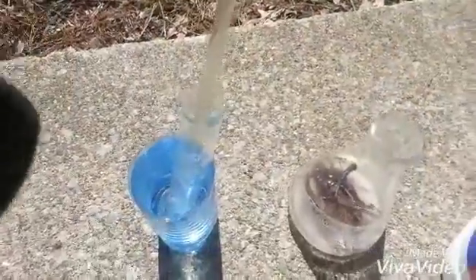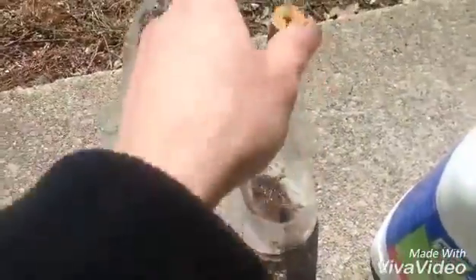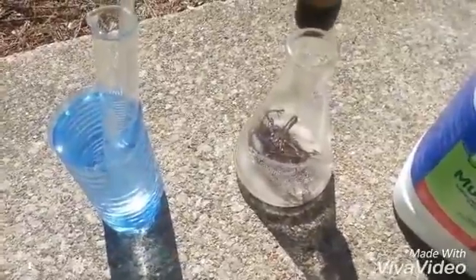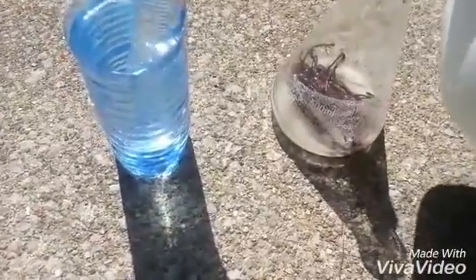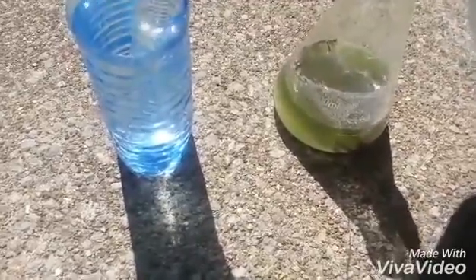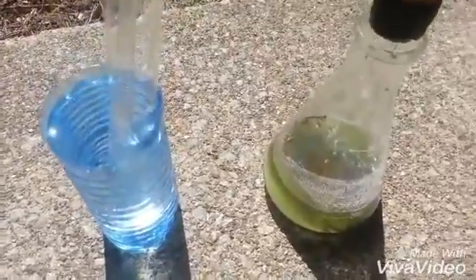Now I will prepare my pipette and tube generator to fit into my graduated cylinder, and have the stopper ready to go over the Erlenmeyer flask. And now I will add 125 to 150 milliliters of 20% hydrochloric acid. And now I stopper it off.